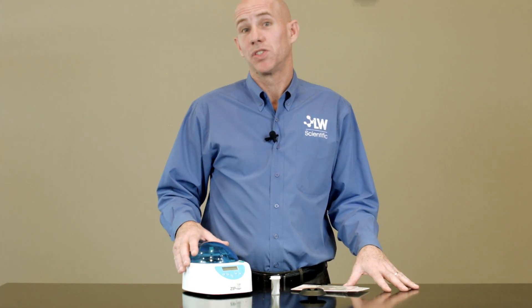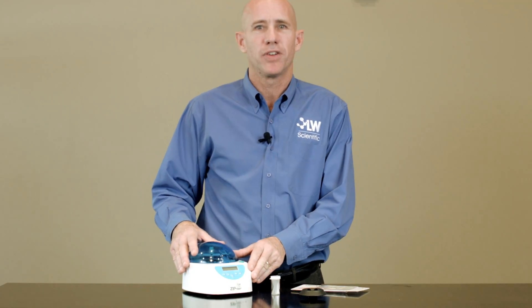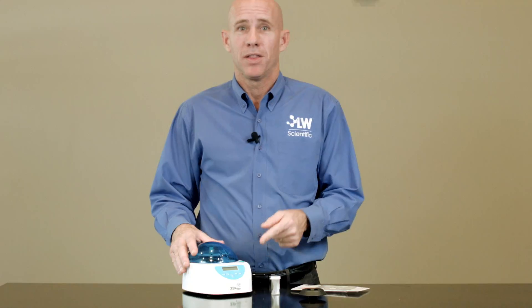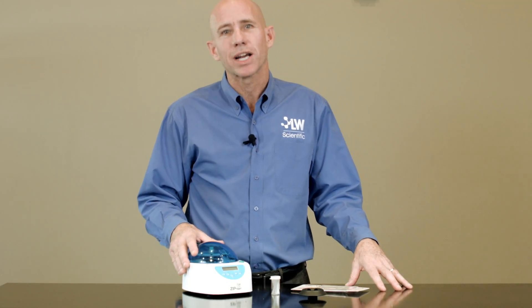Hi, I'm Mike Thomas. The Zip Combo from Jorgensen Laboratories is the hottest new centrifuge in the veterinary market this year. This centrifuge is similar in performance to a stat spin, but easy to buy, easy to set up, easy to use, and at a fraction of the cost.